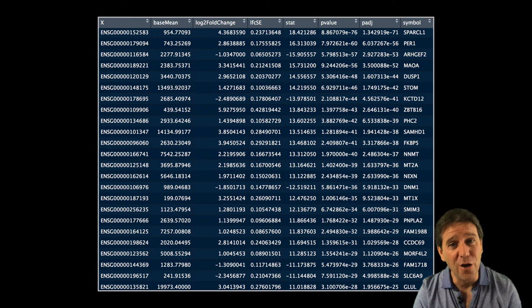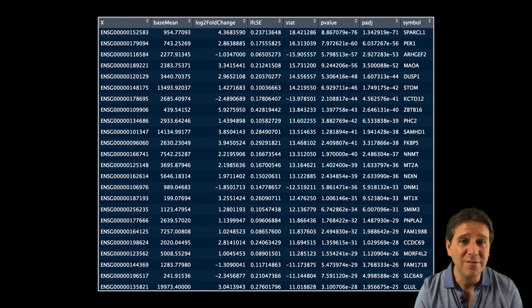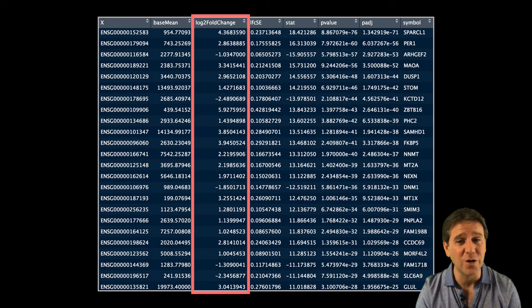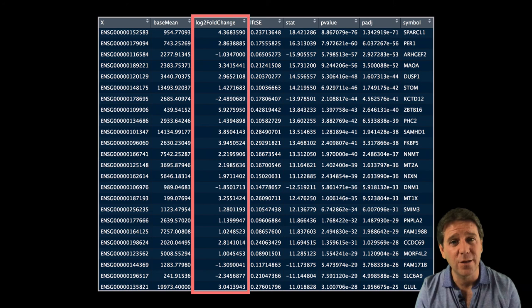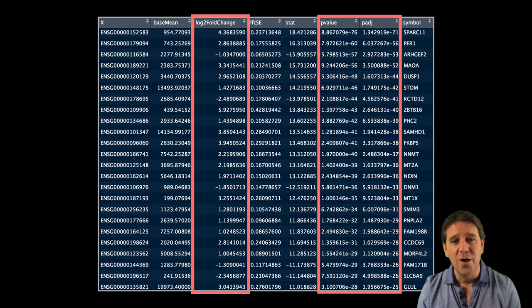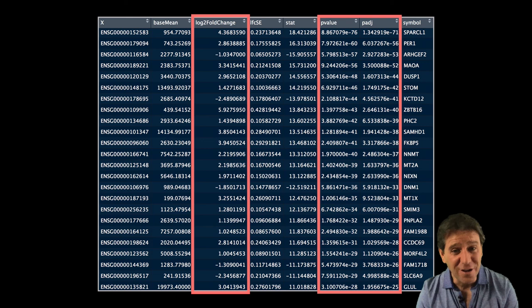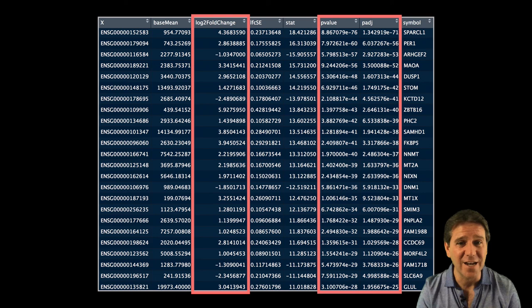What we'll actually get out of this package are results like this, where we have a row per gene. There's a column for log2 fold change—this is an important column that tells us about the change in expression values between our different conditions. You can see minus values in this column and some positive values; this tells us whether the expression went up or down and by how much in these log2 units. Then there are additional columns that report on the statistical significance of these changes. We nearly always want to focus our attention on subsets of genes that change a lot but whose change is also significant between conditions.